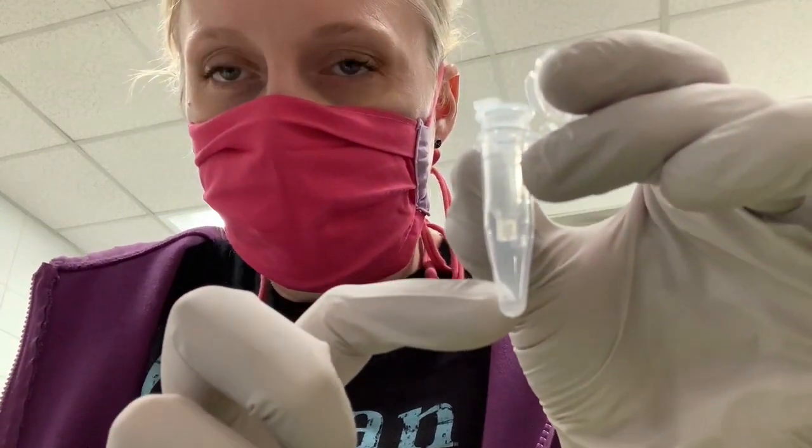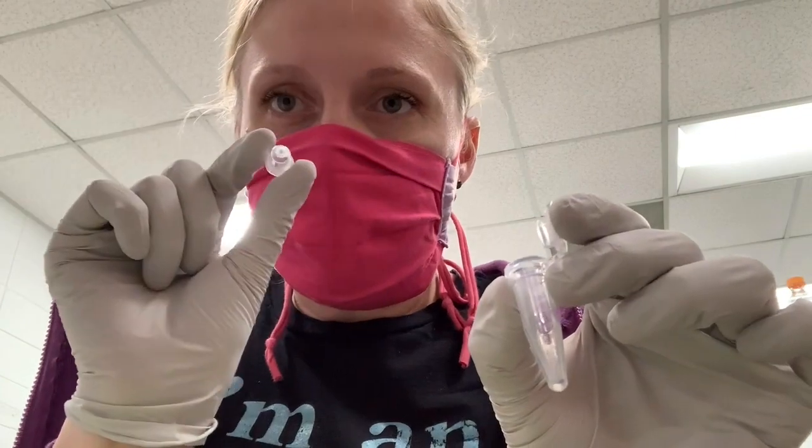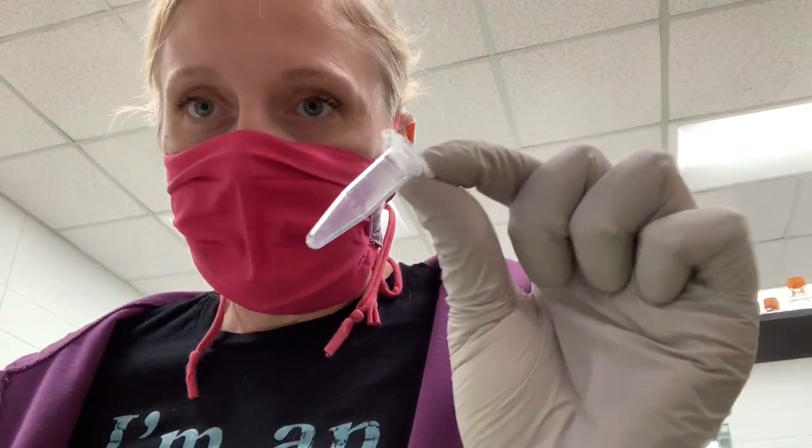When you're finished, you should see a little bit of liquid at the bottom of your tubes. You can take these columns out and just dispose of them, and your purified DNA is present in the bottom of these tubes, which you can cap. I'm going to do that for the rest of my samples. In the meantime, you would want to make sure that you put everything away, so all those buffers and the protocol should go back in the Clean and Concentrator box, and the box should go back on the shelf. And just make sure you leave the centrifuge in good shape. If you spilled anything and need to clean it up, you can work on that. You can ask for help of how to do that.